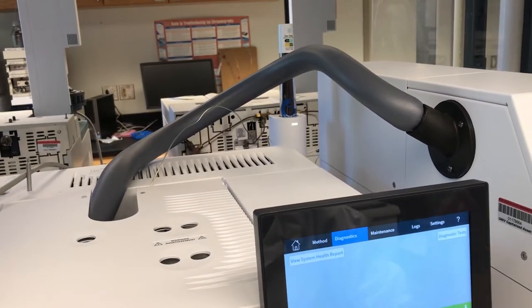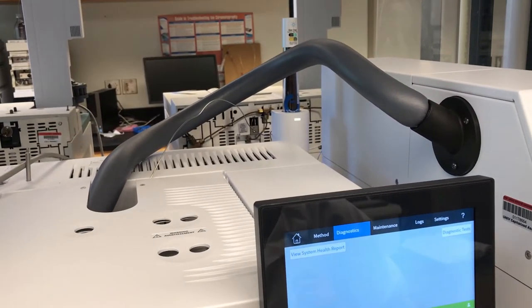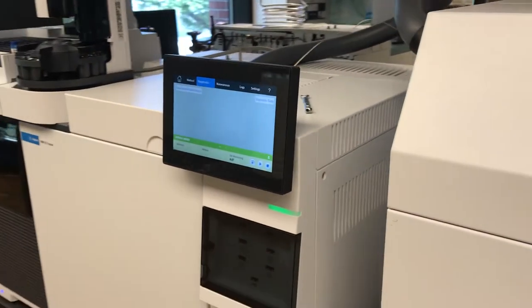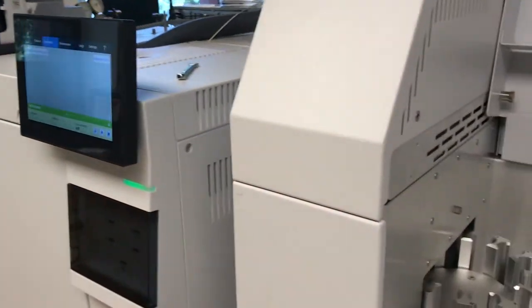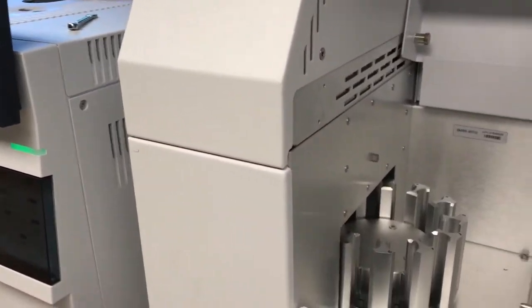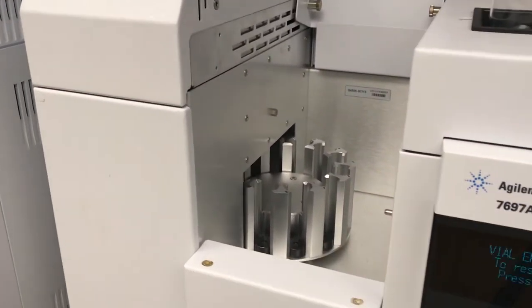There's actually a thin steel capillary that goes from inside the autosampler to the inlet.